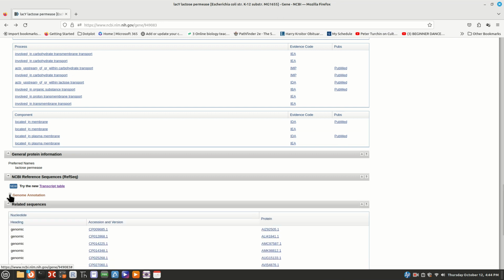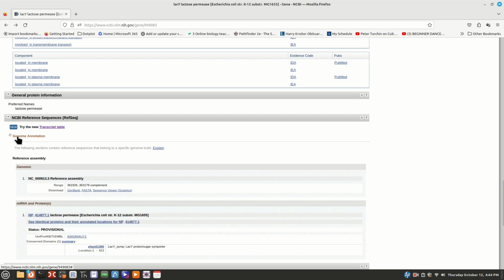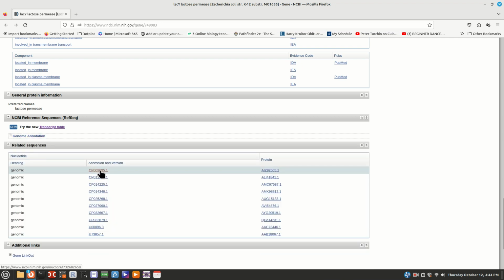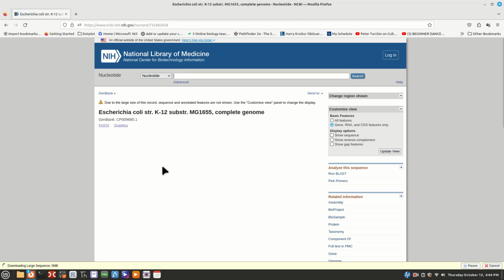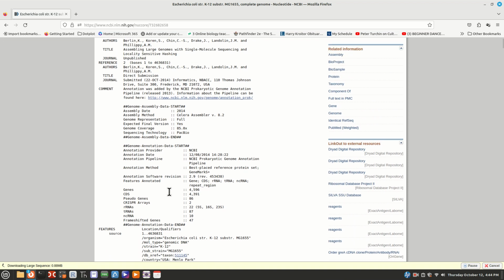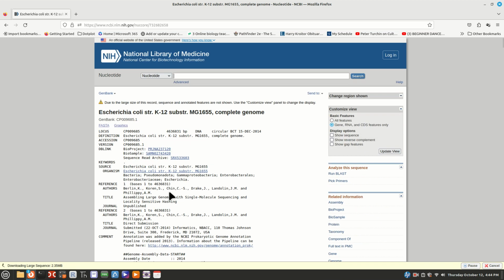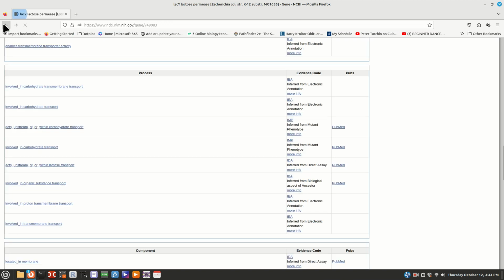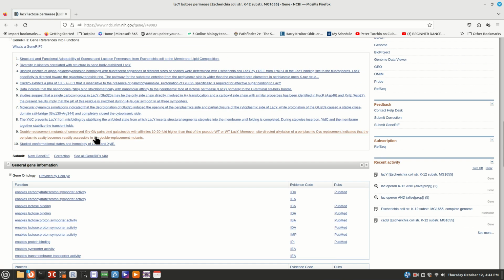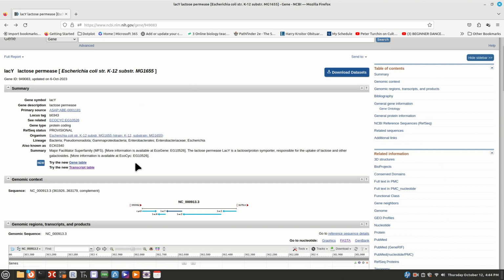Annotation. Now that sounds like it might give you some answers. If you go to the genome annotation, let's hear it explain. Nope, that's for the next thing. Let's go to this. It says it's giving us an annotation. Oh, it does give you a little bit different information. I might look at this if I were you. This might help you annotate this and find some of the... This is new. I would check that out and see if it gives you some answers for where things are located. So it might make your analysis a little easier. Use whatever tools you have available here.